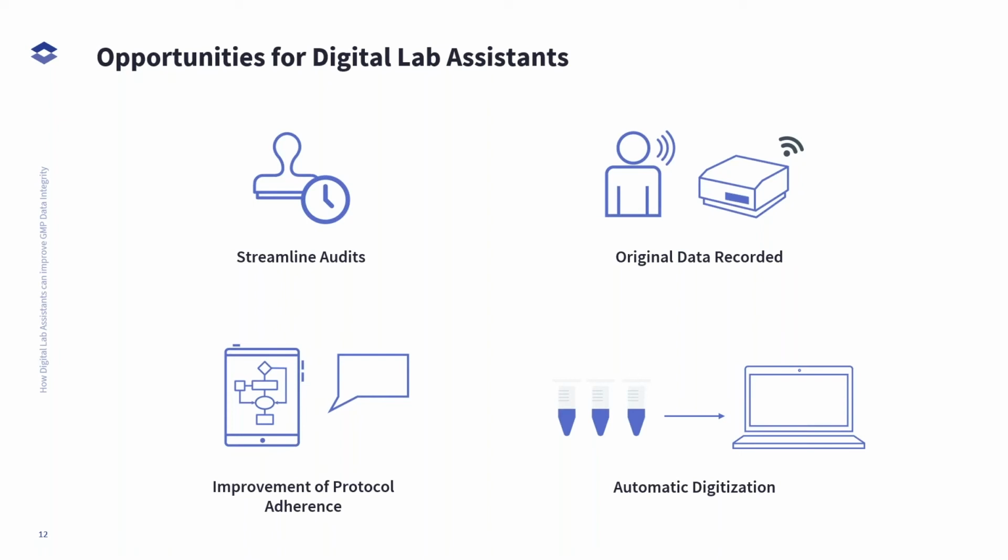And Eric, I'll lead with you as well. On another call we were on, you were discussing an interesting example of working with CAR T cells in a biosafety cabinet, and you were needing to record and document at the same time. Can you talk about that example, and do you see any opportunities there for the use of the digital lab assistant in that case?